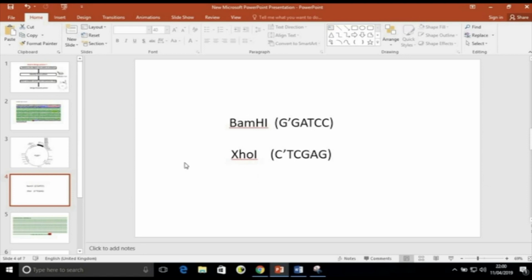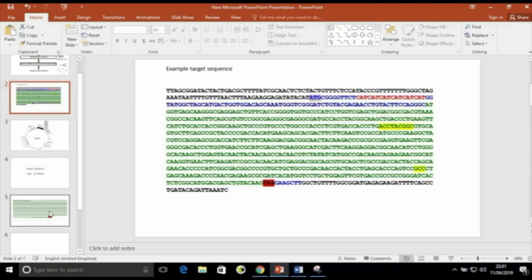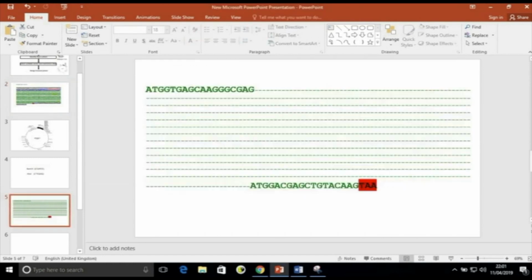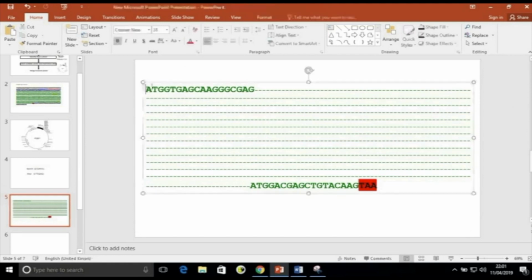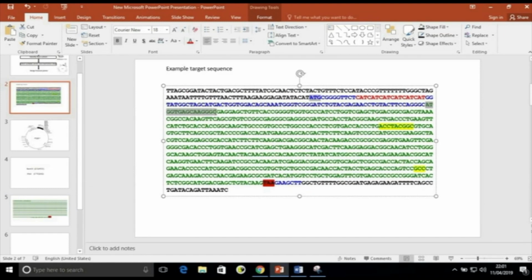After identifying the restriction enzymes and the vector, we will go for designing the forward primer. I will take this sequence. I want to amplify from here to here, so I will copy this sequence here. Designing the forward primer is very easy. You take the sequence, whatever you are getting, up to 15 to 20 bases, as it is.